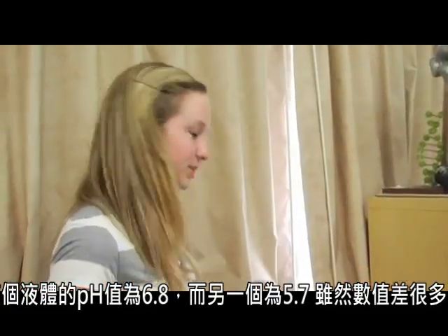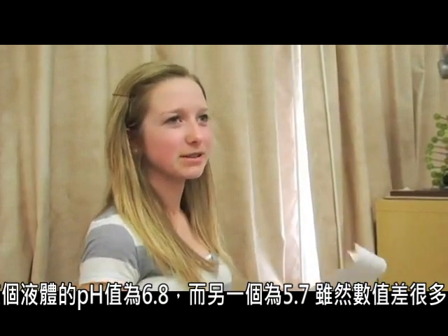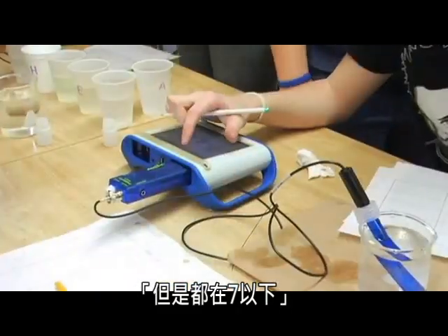6.8 for the pH, and this one's 5.7. So they're still pretty different, but they're both under 7.